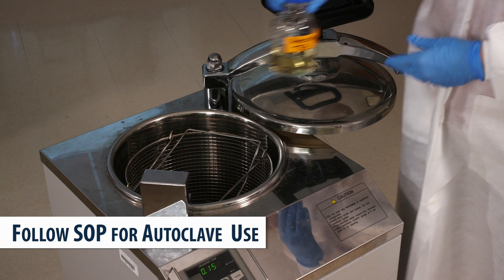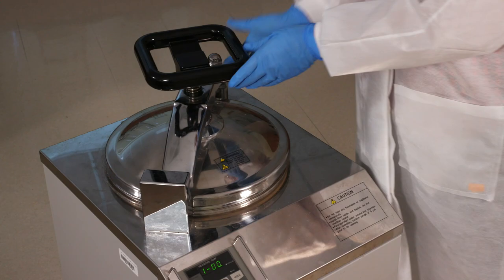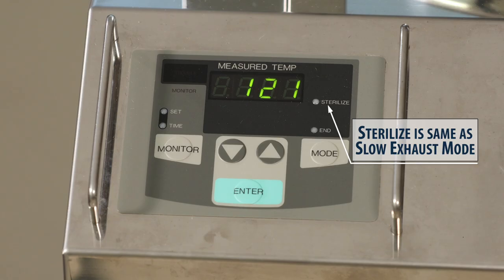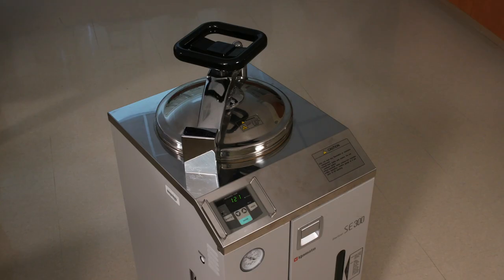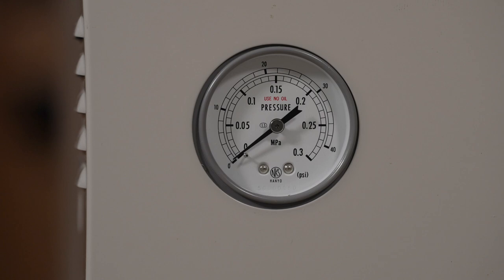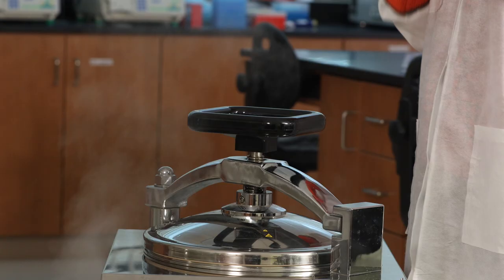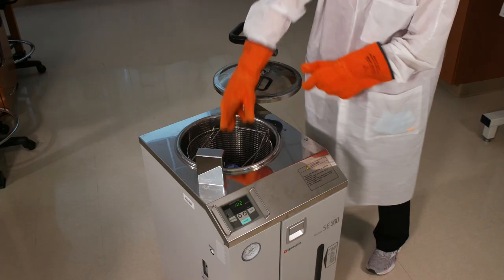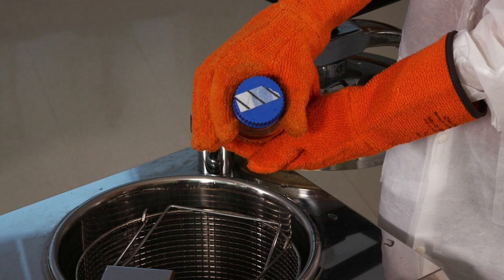Most autoclaves work similarly, but be sure to follow the SOP for the specific unit in your lab. Select Slow Exhaust Mode. It's labeled Sterilize on this unit. Now we'll wait for the cycle to complete, and for the pressure gauge to read zero. Use heat-resistant gloves and stand to the side to open the autoclave.